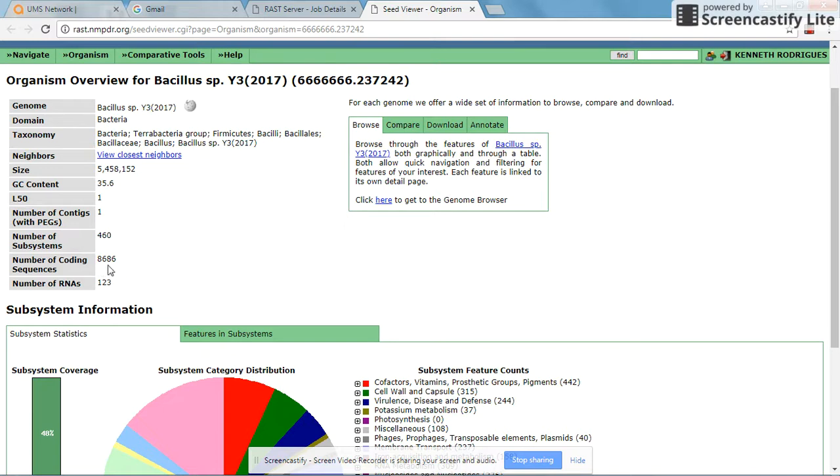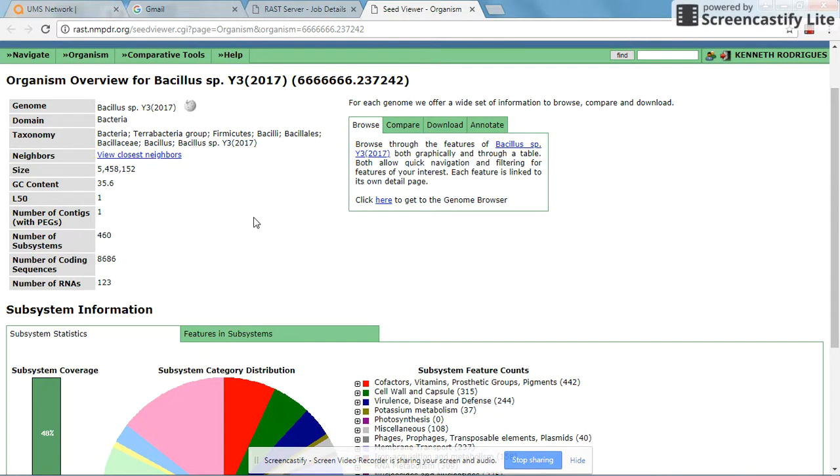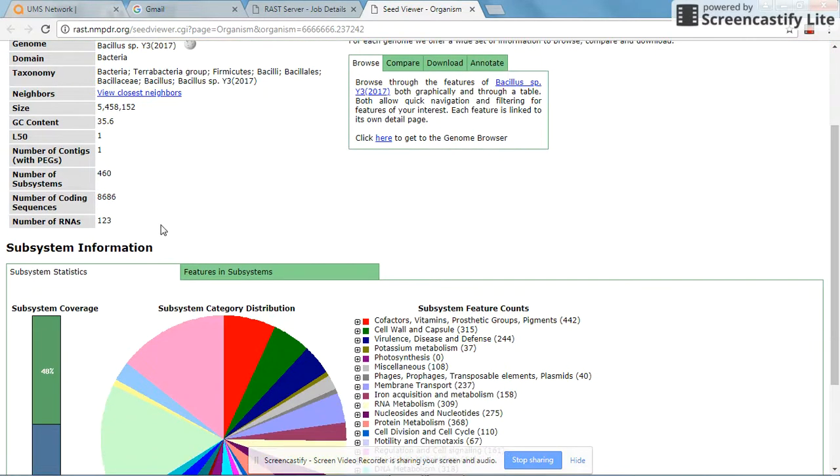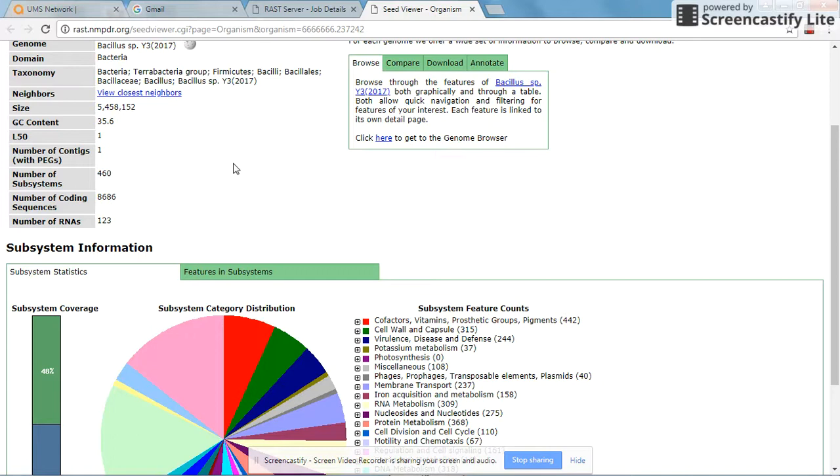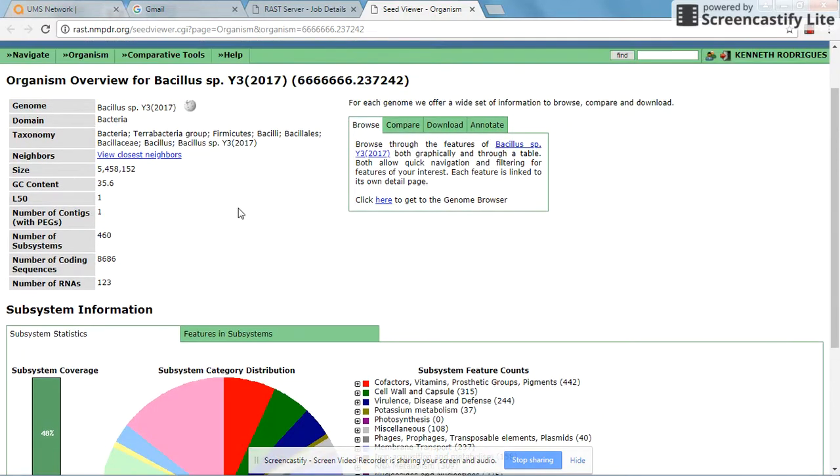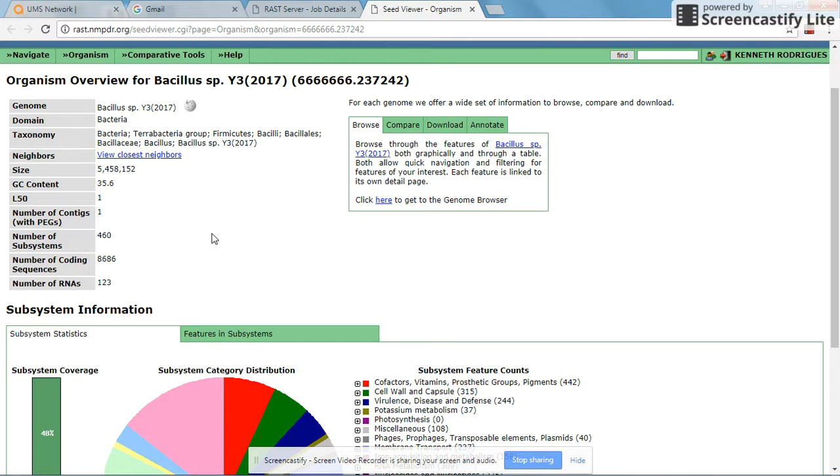The number of coding sequences are 8,686. This includes the non-coding RNAs as well. The number of RNAs are 123, which is an adequate representation of the genome of Bacillus. By observing this entire set of parameters, one can determine if one's genome sequencing is complete or incomplete.